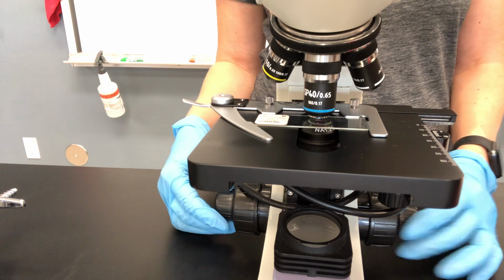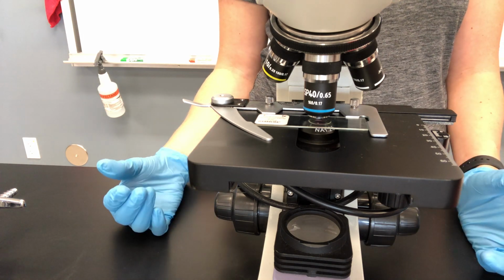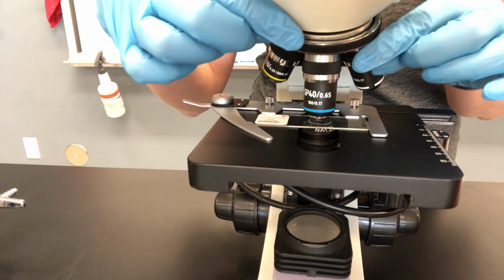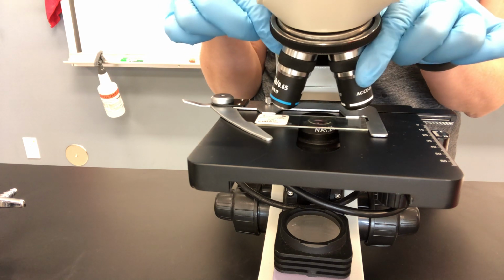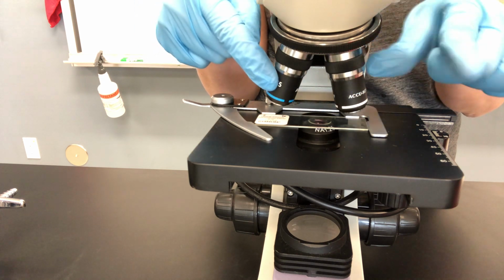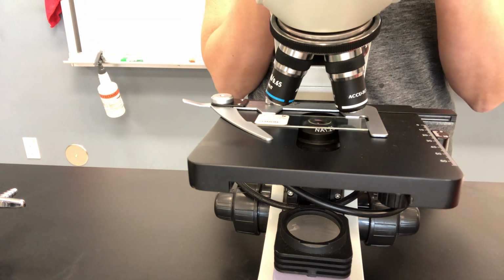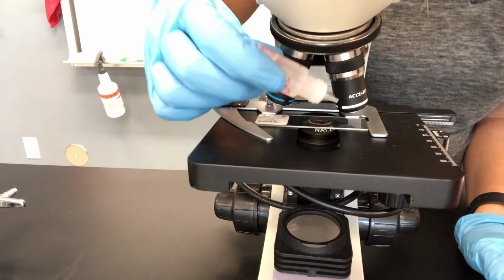So once you're ready to go up to oil, you have to have a nice clean view on this high, what I call the high dry, this high power with no oil. And then when you're ready, so it looks all good in your eyepieces, you're going to rotate the objectives halfway between the high dry and the oil immersion. You're going to take your oil and drop just a small drop right over the specimen.